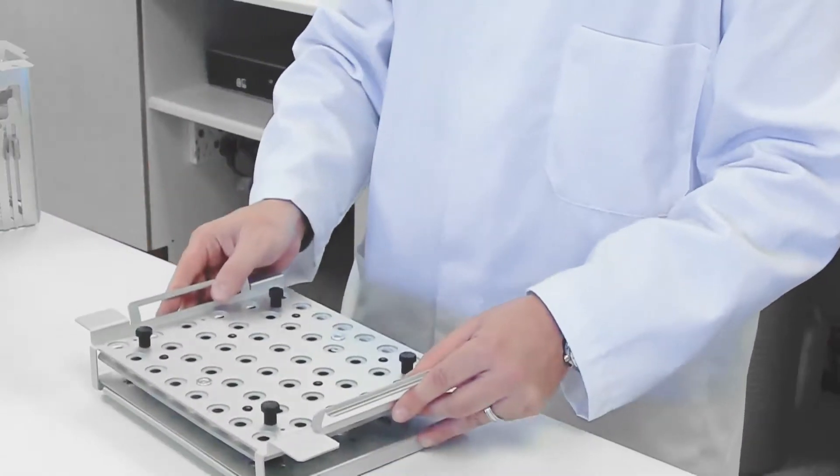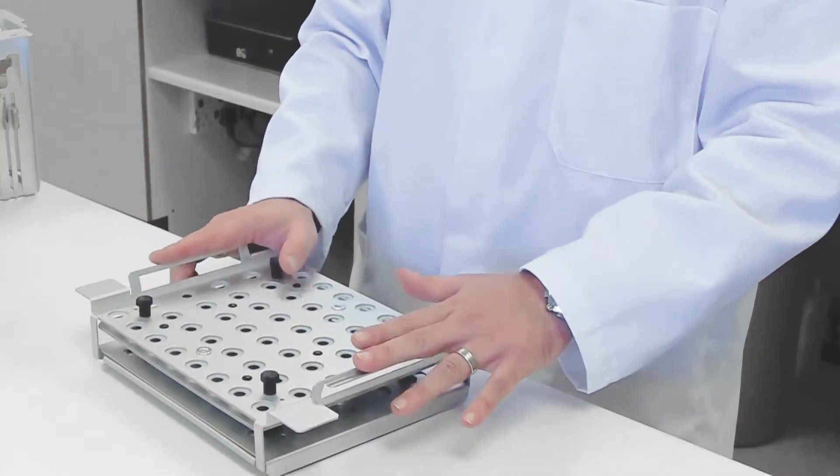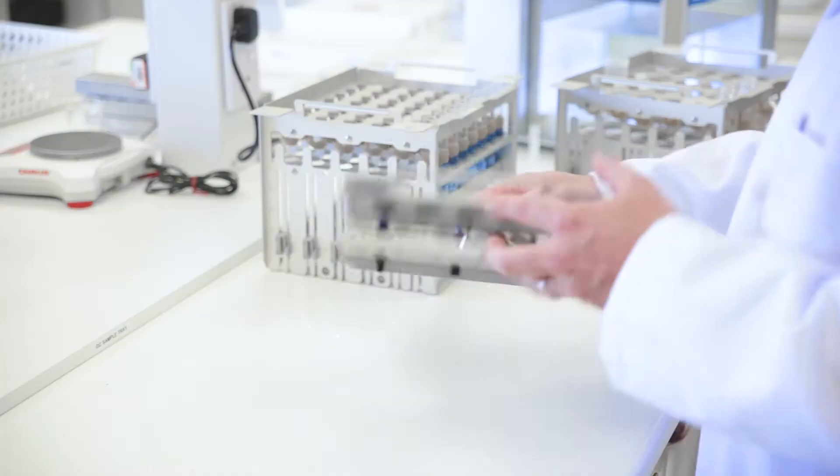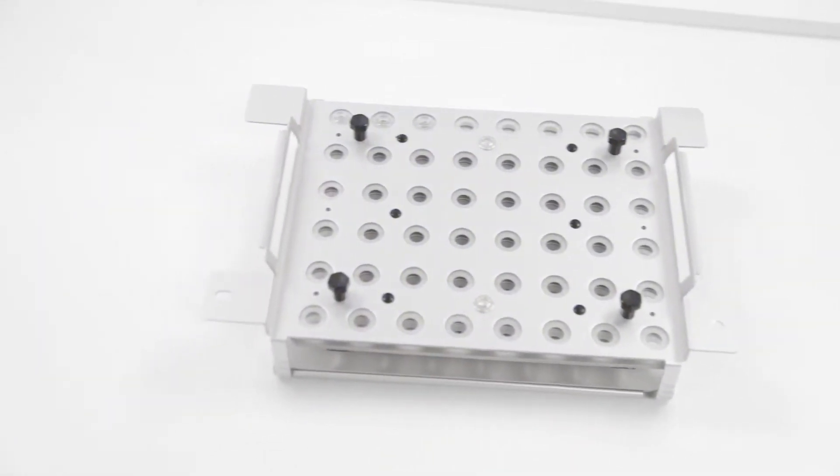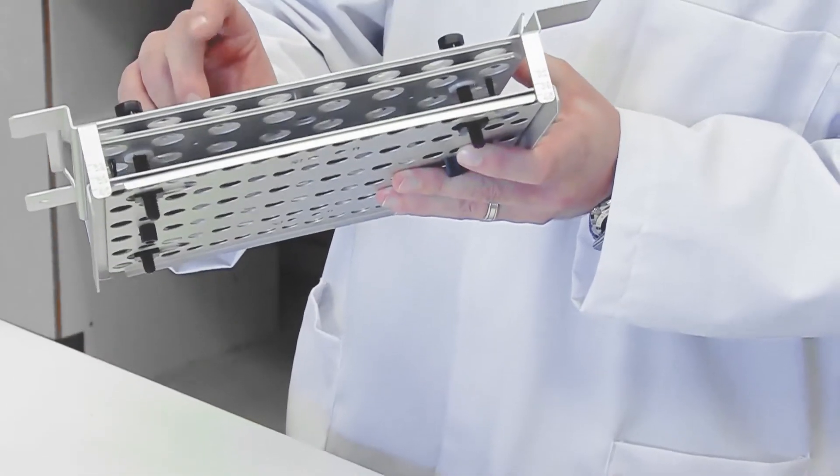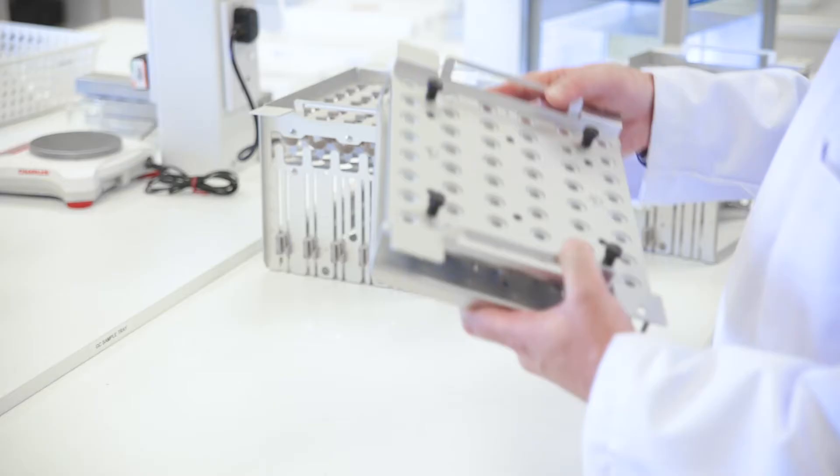Finally, we've got a rack here for much smaller sample vials. This is aimed at the auto-sampler vial market, maybe small Eppendorf tubes, and it's a pretty ingenious design.